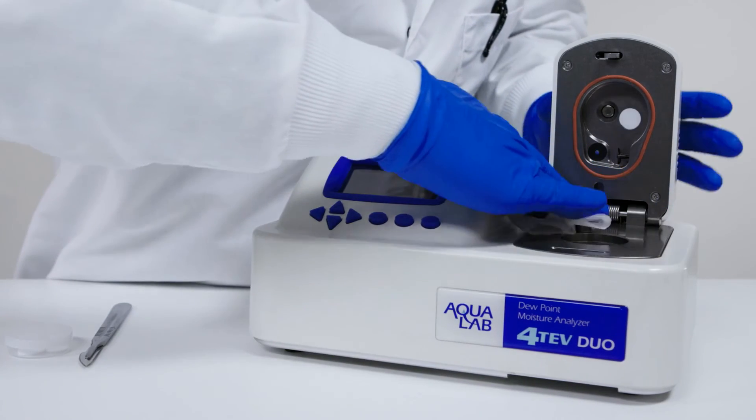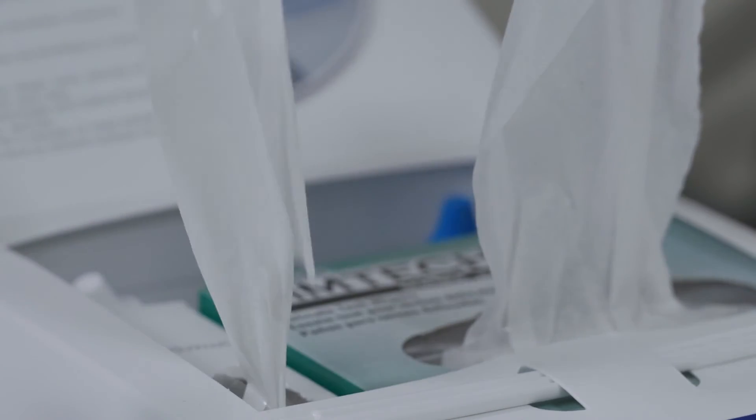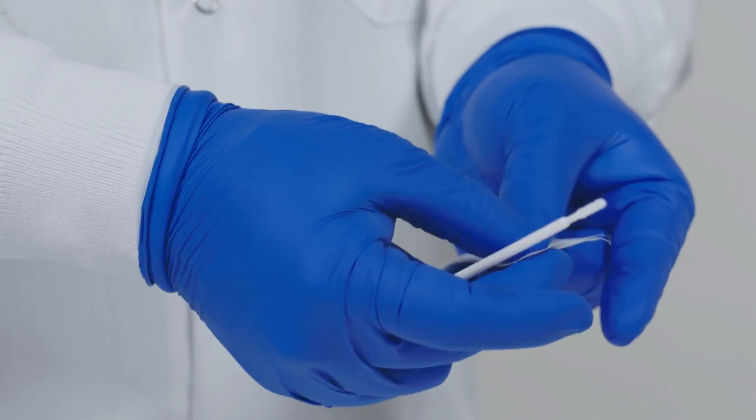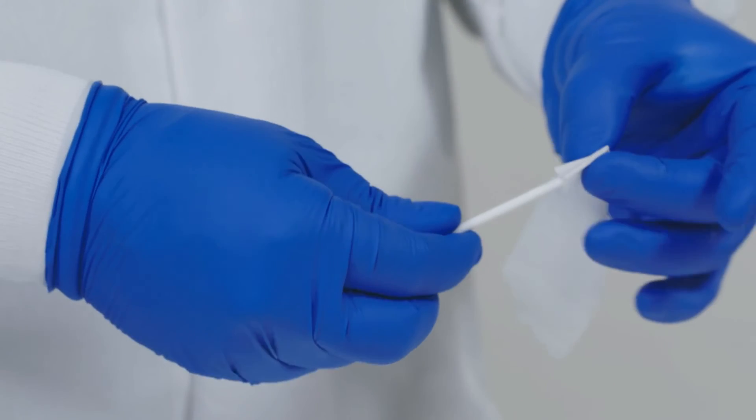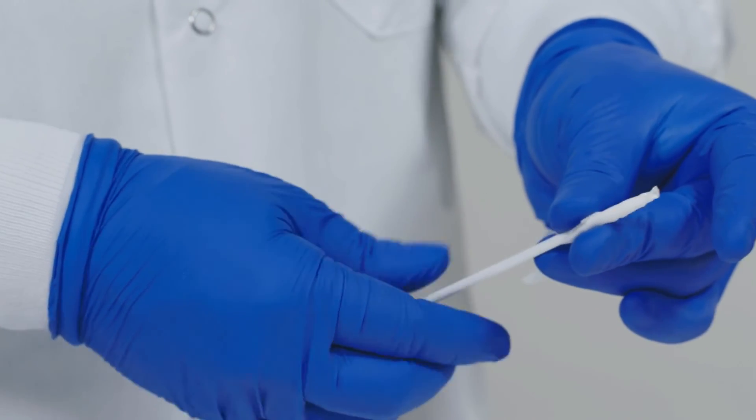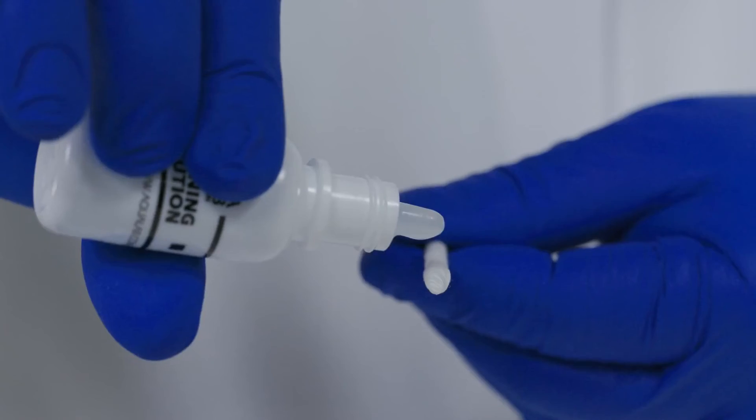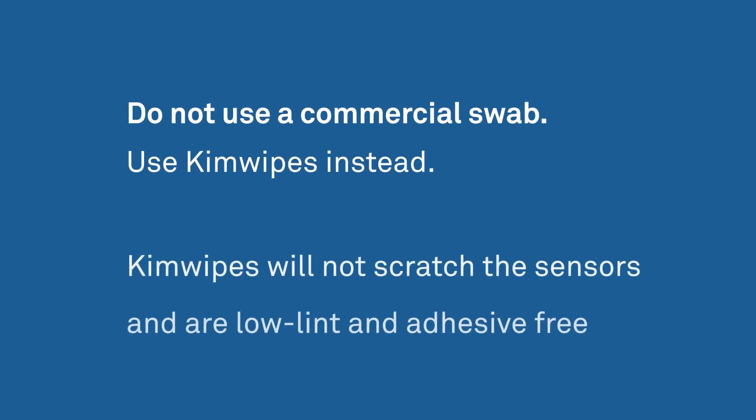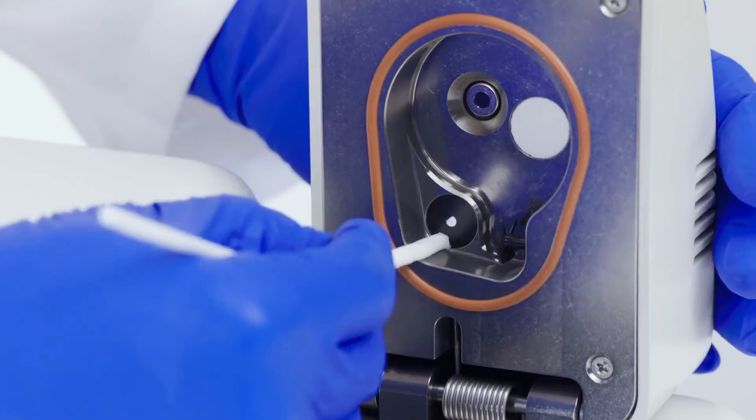Once the surface area of the sample chamber is clean, clean in and around the fan and the sensors. To do this, use a cleaning rod, strips of Kimwipes, and isopropyl alcohol or Aqualab cleaning solution. Wrap a Kimwipe strip on the top of the cleaning stick. The first step to wrapping a Kimwipe is to make two folds. One fold over the head of the stick and one over the top to cover the tip of the head. Then twist the stick with one hand while holding onto the Kimwipe with your other hand until the head of the stick is covered. It's important not to use a commercial swab because the adhesives used to glue the cotton to the stick will contaminate the mirror and sensors. Kimwipes won't scratch the mirror and are adhesive free and low lint.